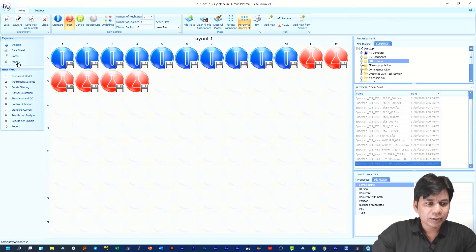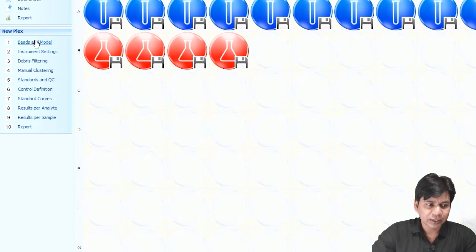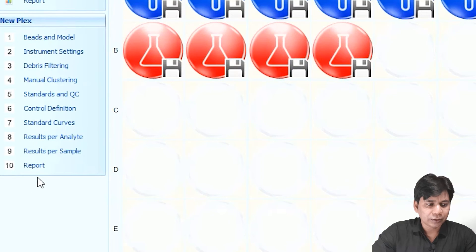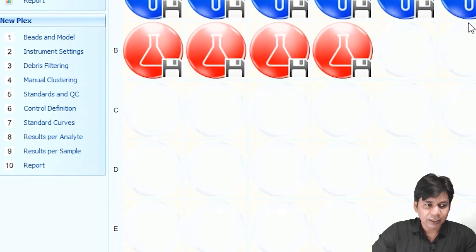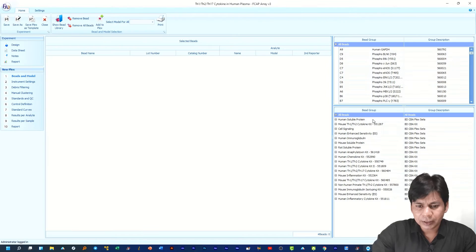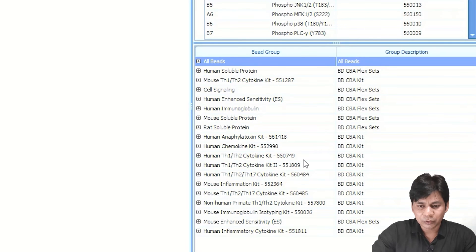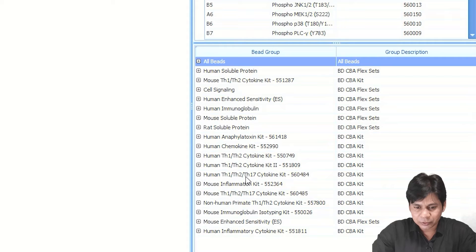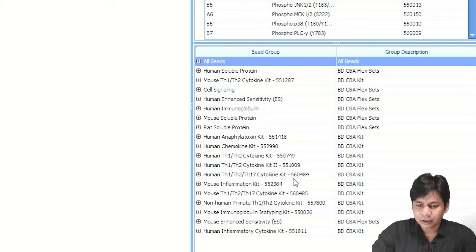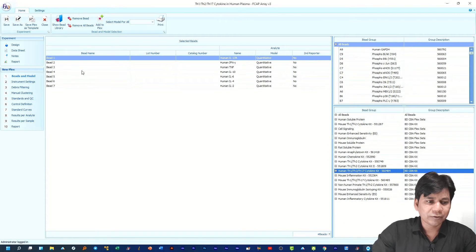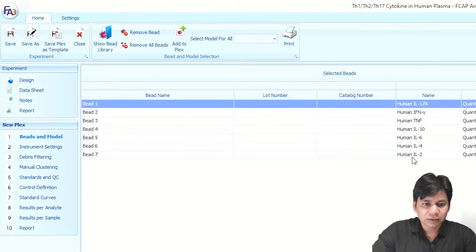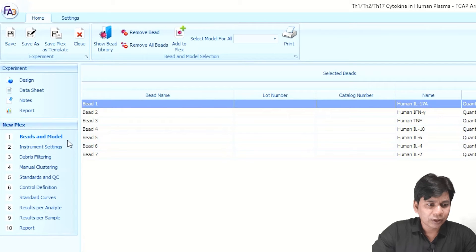After selecting the standard and sample in the layout, click on 'Bead Model.' The workflow — called NuPlex — is divided into mainly 10 parts. For any experiment data analysis you have to follow each step one by one. The first step is Bead Model. After selecting your samples and standards, click on Bead Model and select the CBA kit you used for your experiment. We used the Human Th1/Th2/Th17 Cytokine Kit with catalog number 560484. You can see the information: this kit contains seven beads for IL-17A, IFN-γ, TNF, IL-10, IL-6, IL-4, and IL-2.